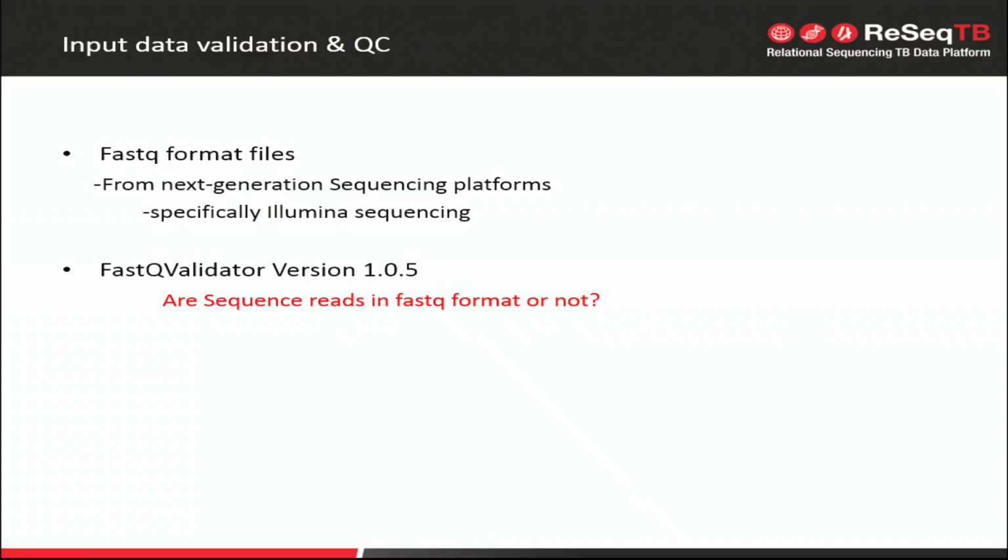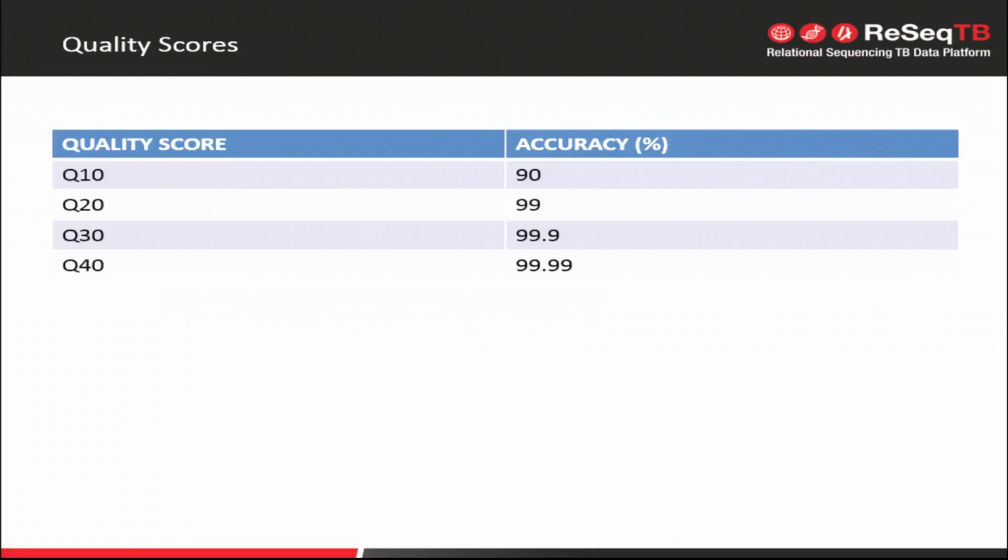What I'm going to be talking about moving forward is a lot of what are called quality scores, and I thought, since one slide's out of order, I should define what some of these terms mean. When you hear people talk about quality scores, Q10, Q20, Q30, Q40, what does that really mean? A lot of it is based off the Phred scoring as it was in Sanger, and it's the ASCII characters, the basic computer language within the file.